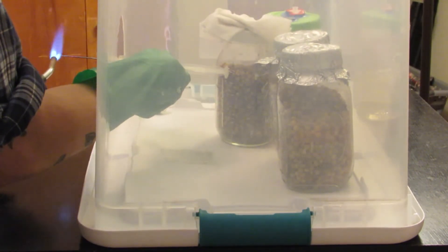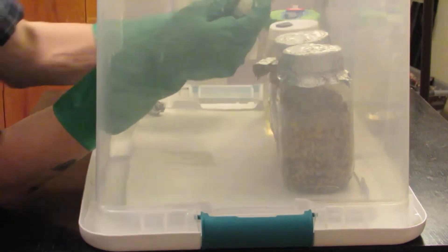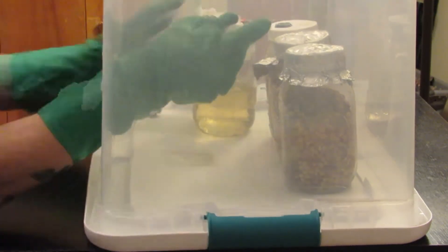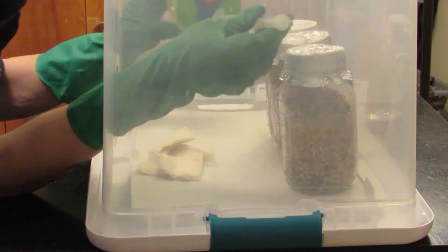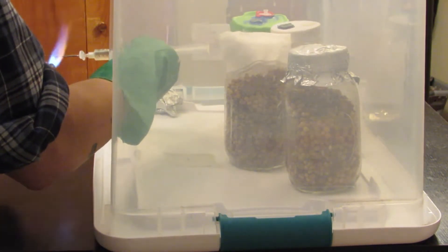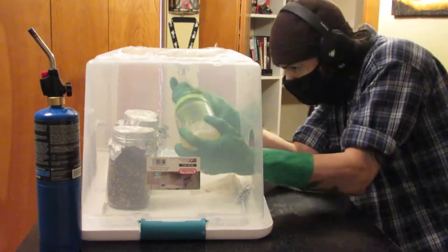One thing I would like you to notice is that I'm flame sterilizing my needle on each injection. As I draw up from my jar of liquid culture, I like to tilt the jar over on its side. This gives easy access to the thick gooey mycelium. I'm loading up a whole syringe full, so you want to make sure you get as much of that white gooey goodness as you possibly can.